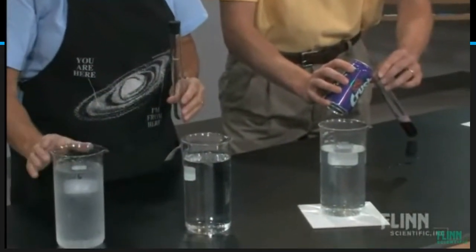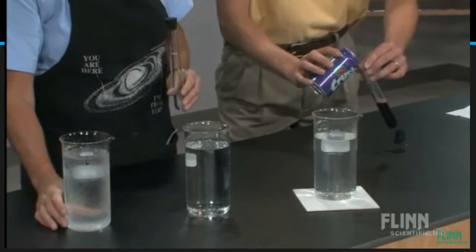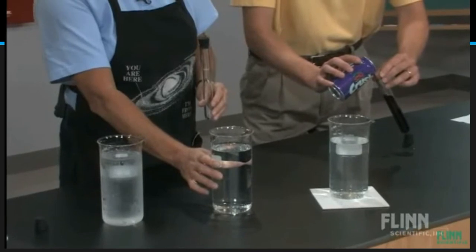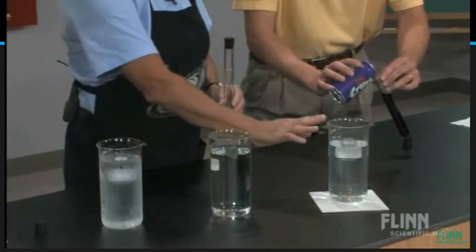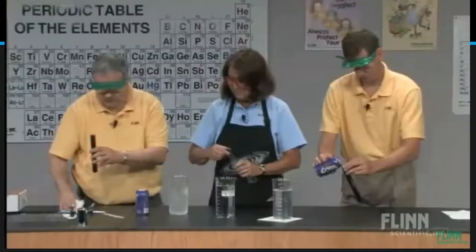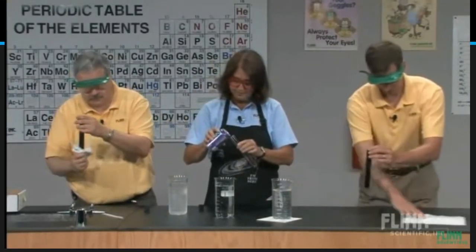Jeff has a beaker of cold water. It's about 0 degrees. There's a small amount of ice still in it. I have room temperature water, which today is about 27 degrees. And Mike has the hot water. What we're going to do is simply fill our test tubes up with the soda without spilling.